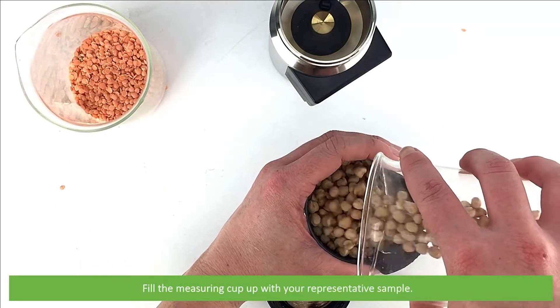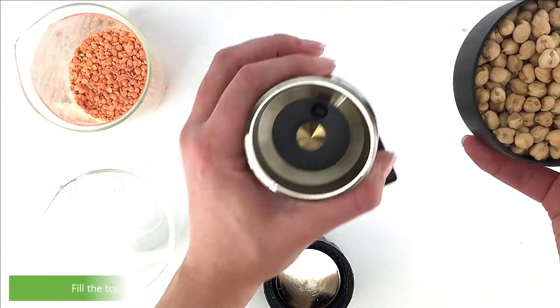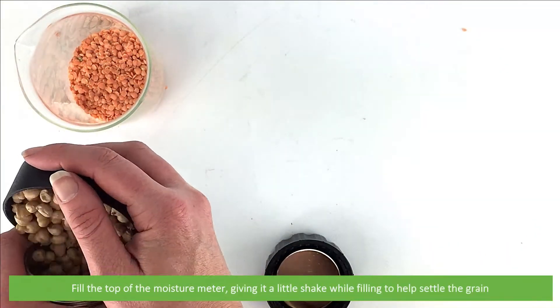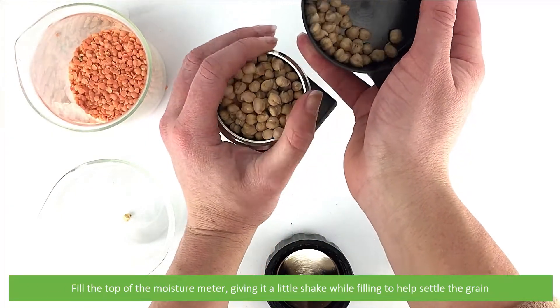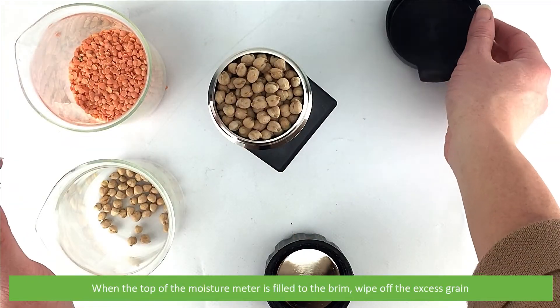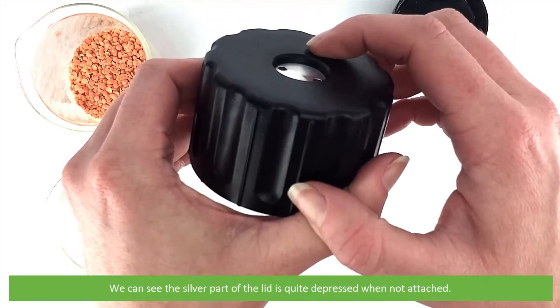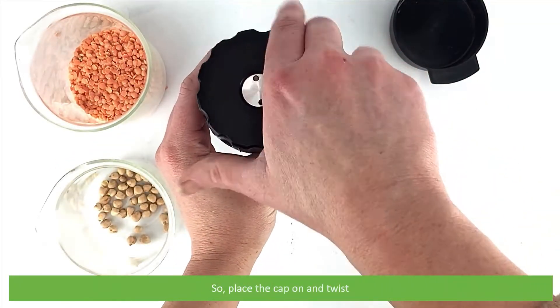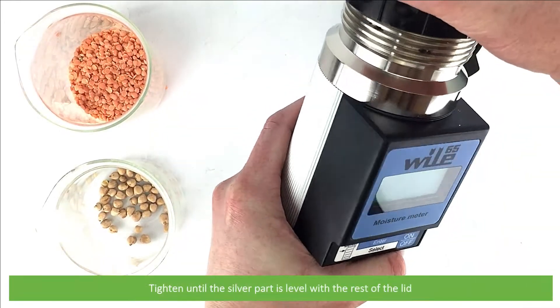Fill the measuring cup up with your representative sample. Fill the top of the moisture meter, giving it a little shake while filling to help settle the grain. When the top of the moisture meter is filled to the brim, wipe off the excess grain. We can see the silver part of the lid is quite depressed when not attached, so place on the cap and twist. Tighten until that silver part is level with the rest of the lid.